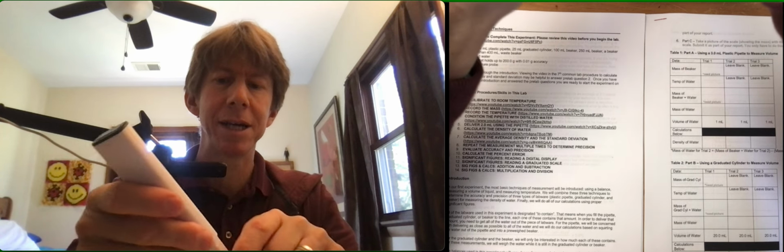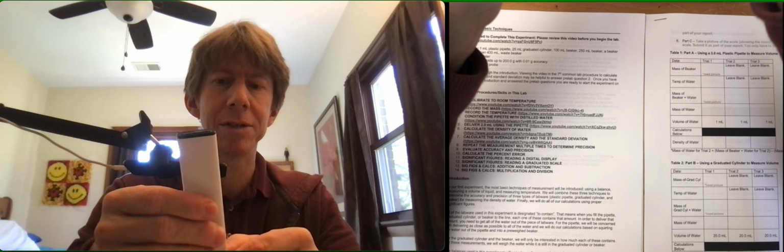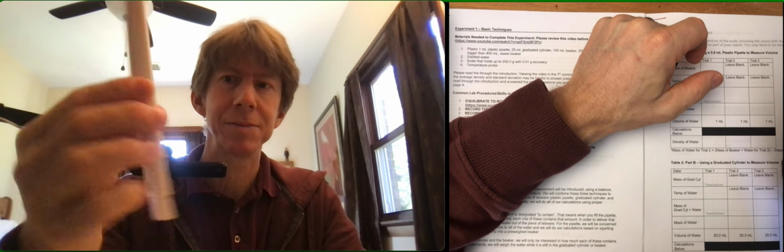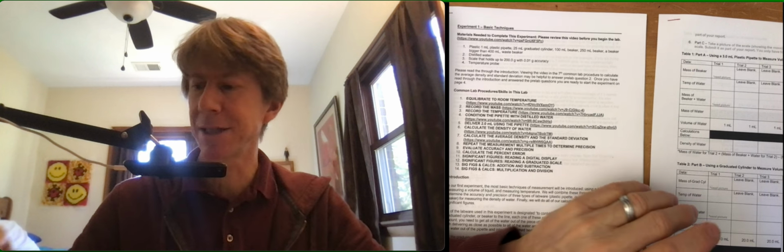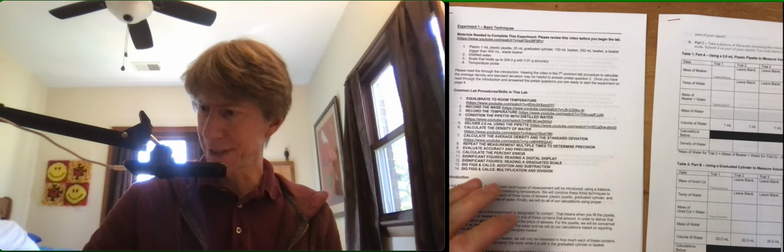In order to use mine, I have to press the on button, and then I have to press the mode button twice in order to get temperature to display. So you should be able to do something similar. Sometimes on some of these models, the temperature just comes right up. Other times you have to press a couple buttons. And then I just press and hold the on/off button to make it turn off. So now it's back off again. So that's all the materials that I need.